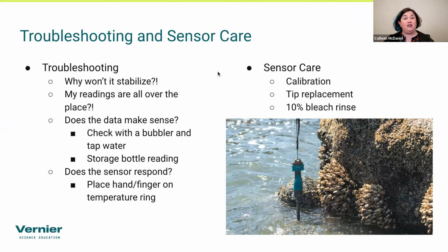If you have the electrode style dissolved oxygen probe, that one we see a lot of problems with because people accidentally store it wet. That probe actually needs to be stored dry. You need to make sure to empty out that electrochemical filling solution that goes in the tip, and dry out as much as you can, because storing it wet can cause corrosion and actually can cause it to eat through the membrane on the tip of that probe.